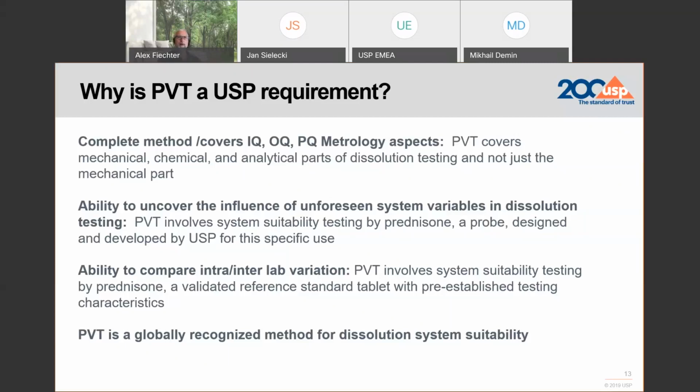And with our way of giving you these recommendations and trainings, I think you are on the safe side in applying the performance assessment for your dissolution tester for various requests from various competent authorities.